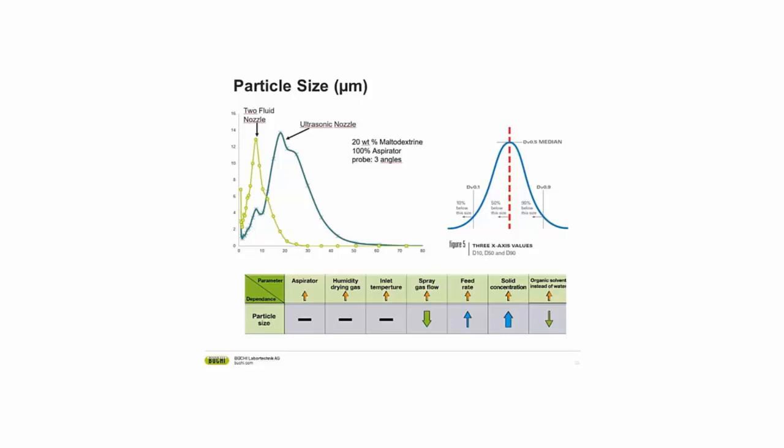The drying path is all of the parts of the spray drying cylinder, and that is around a meter for a lab unit. If the droplet is too big, and we are talking about droplets that give you a particle size of around 50, 60 microns, they are just too big and there's no way we can dry them in 1 meter length.